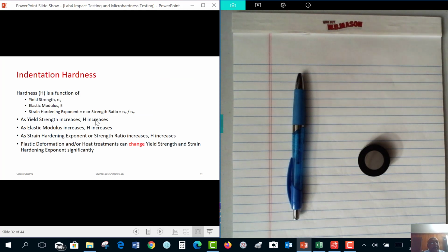Okay, the second part of our lab, I hope you enjoyed very much. It has got hands-on activities. We are again going to focus on indentation hardness.